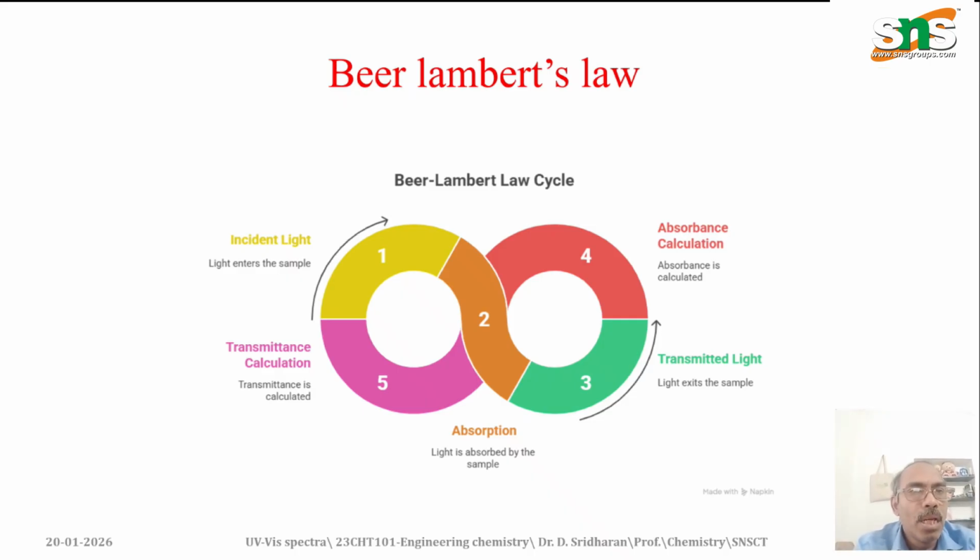Fourth is the absorbance calculation, and finally the transmittance calculation. We can get the final results. So it involves several steps, basically the absorption of light by the molecules.